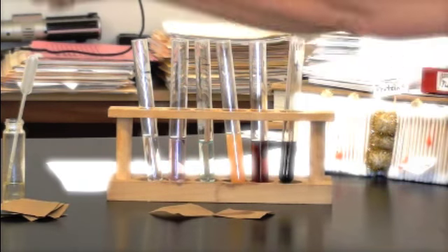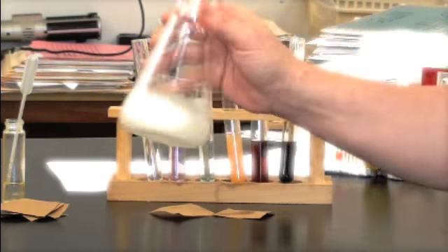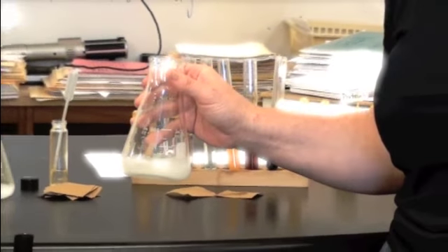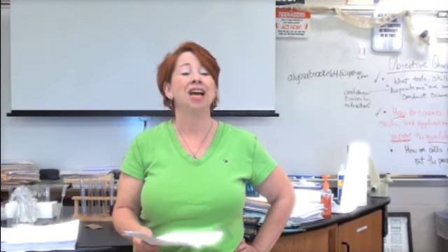Then once we have used these to create this, then you will be given the unknown solution, which contains 2 of the 4 test subjects. You must tell me which 2 are in here. Okay, student scientists, it's now lab time. No, not too much. Let's get started.